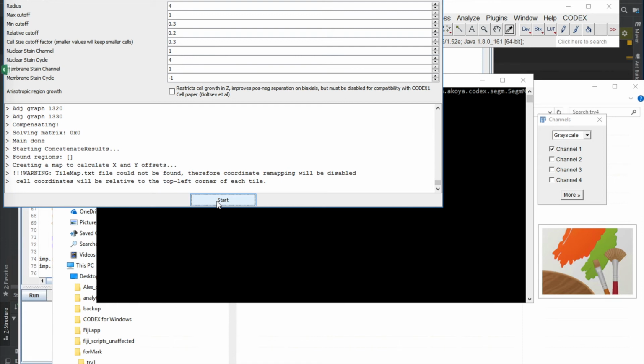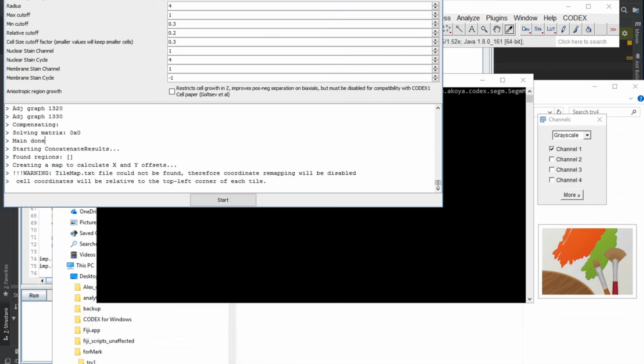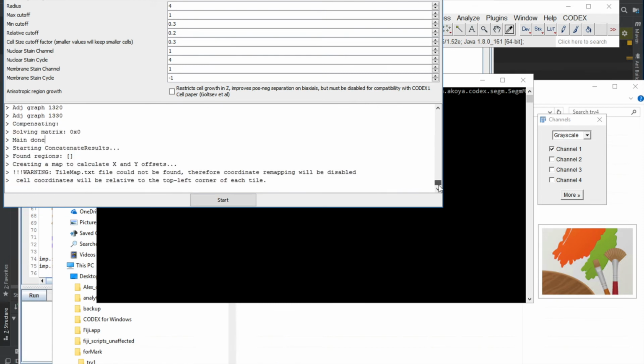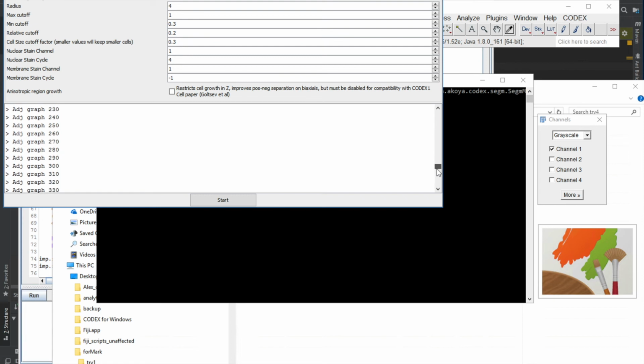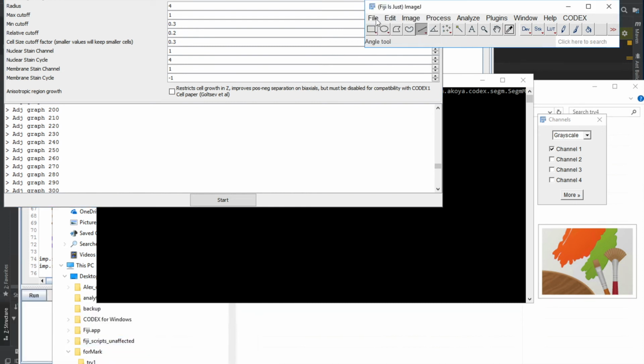Weird. This is weird. I don't think it found any cells for some reason. Hold on, let's take a look at this.